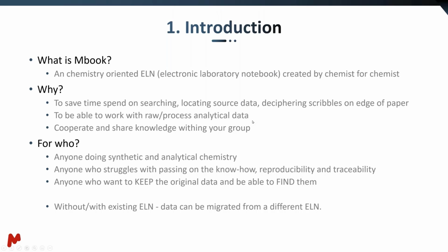Second, because you can work with raw or processed analytical data from various spectroscopies. So if you have raw NMR data, LCMS data and GCMS data, you can save them all to Mbook. They are processed, but at the same time you are keeping the raw data. So if you upload the raw data in a zip file, they will be processed automatically, but you will keep the source data as well.